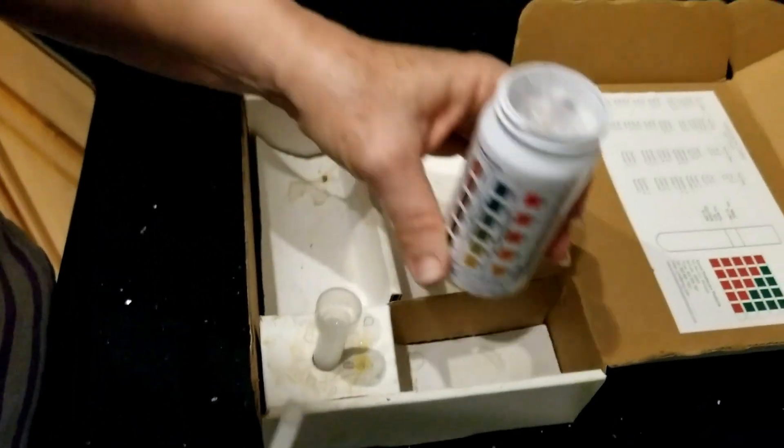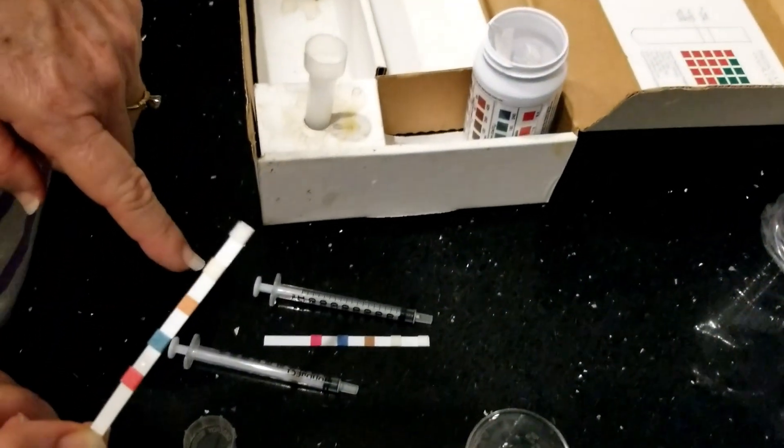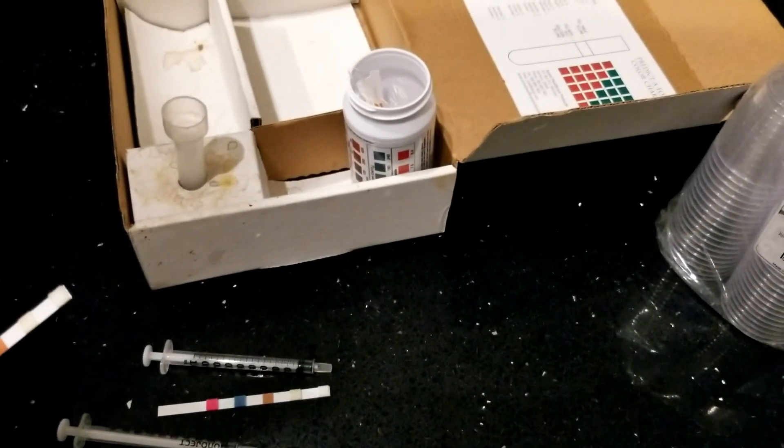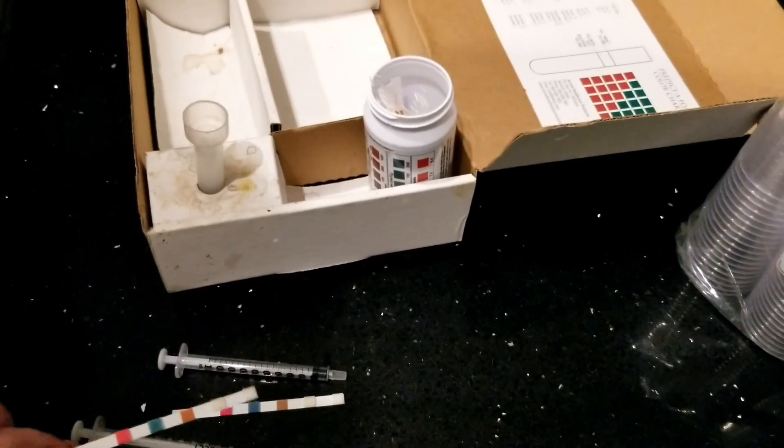When they get this close, I test them daily. When they are like Mandy, I test every three days or more. So that is how you test a mare's milk with the pool test strips, or the water quality test strips.